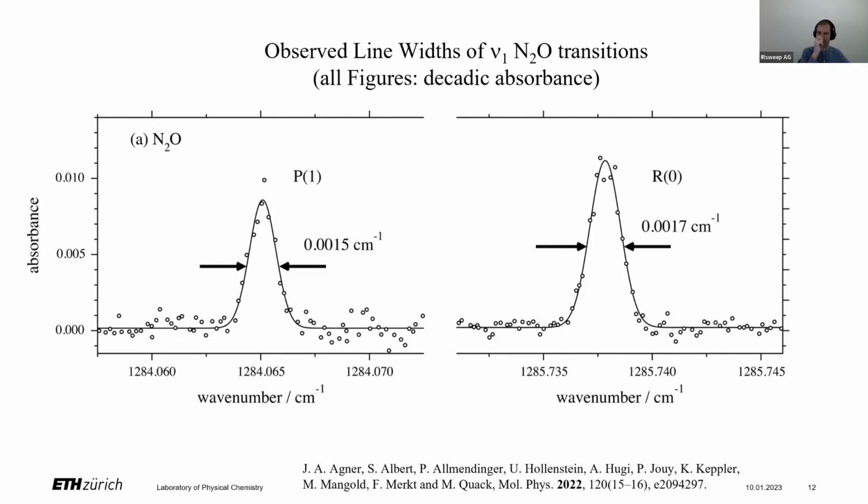This question probably has many dimensions, and of course depends a lot on the substance and the molecular beam that you use. But maybe answering it just in terms of the signal noise, we can see it right here on the slide. There is a signal noise on the order of 10 to the -3 absorbance units.